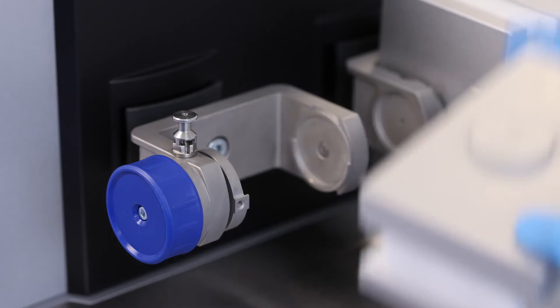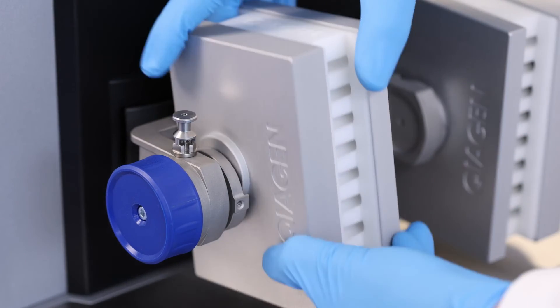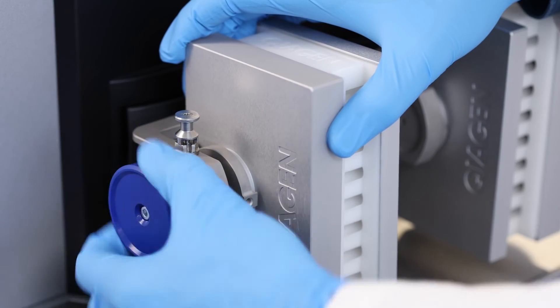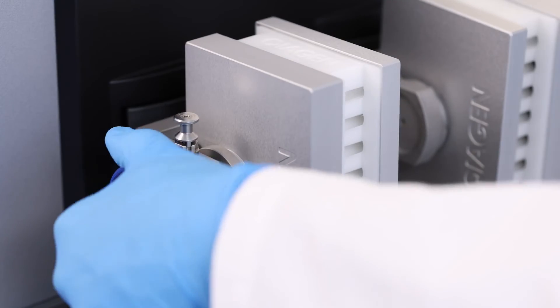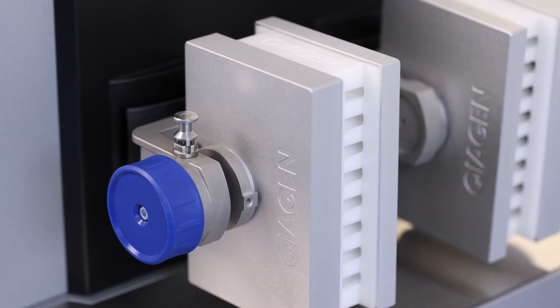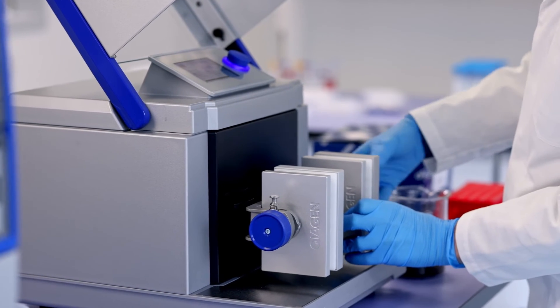Disengage the locking pin, then place the adapter into the clamp. Turn the knob until you feel a resistance, then engage the locking pin. Turn the knob until you hear five to six clicks. Repeat this with the second adapter.